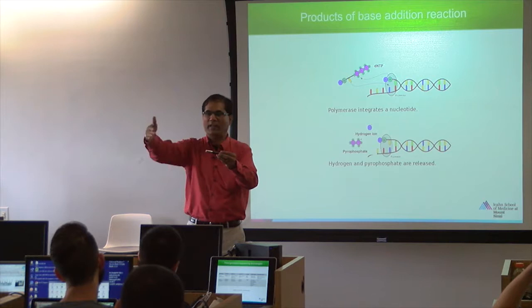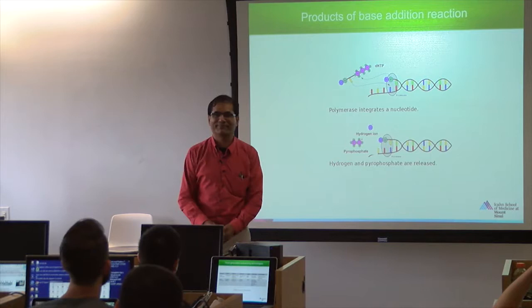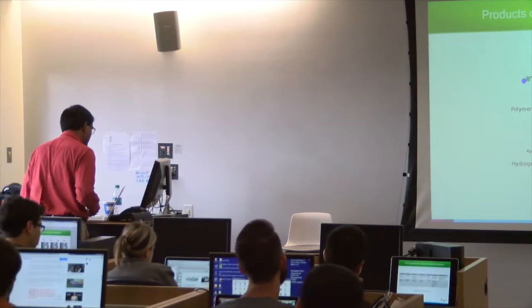If there are any structural variations in the DNA, or you can sequence the entire cDNA, look for all the splice variations. Right? How many exons, combinations of exons are different, you can detect that. Different things you can do. Exactly for that, this technology was developed. Just go through that. I have to fast forward these.